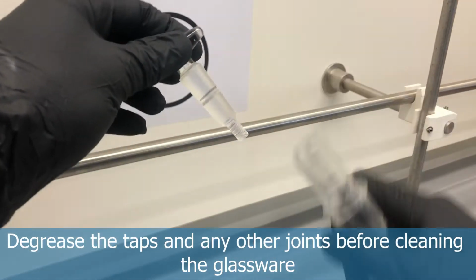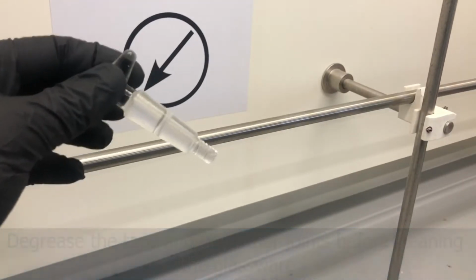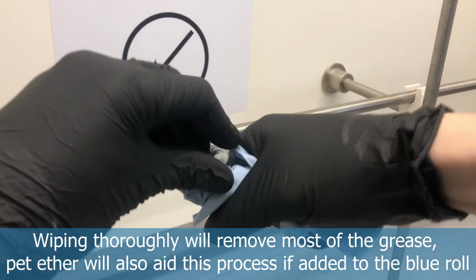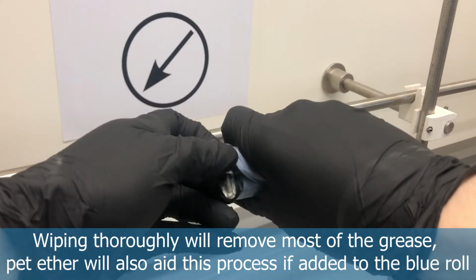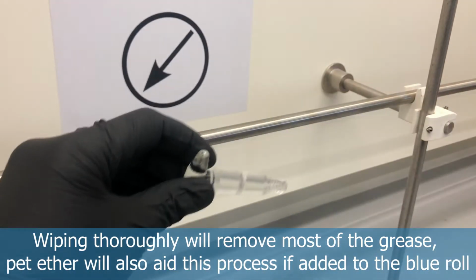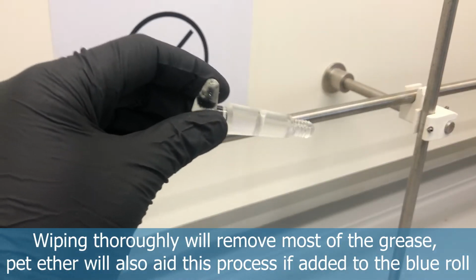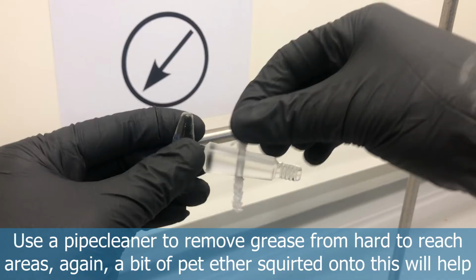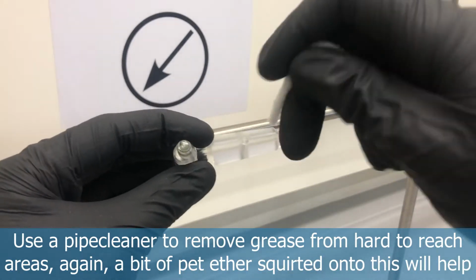So moving on to degreasing, we need to do this before we clean up our Schlenk flask at the end of the day. And as I said, grease is a major contaminant in this kind of work, and so we need to make sure that we're very thoroughly removing the grease from our tap. So a bit of blue roll will do the trick, and really you need to be squirting a little bit of pet ether on there as well to thoroughly remove the grease.